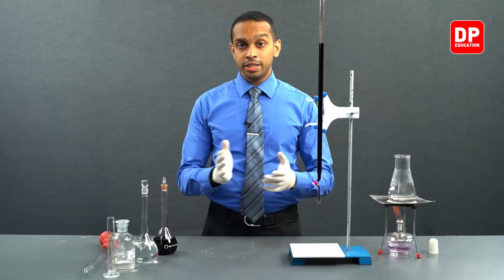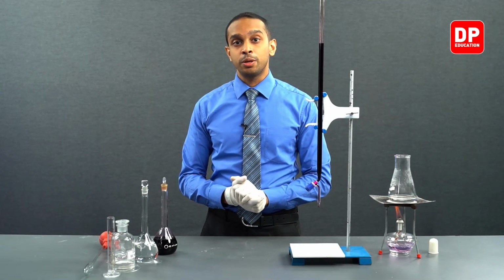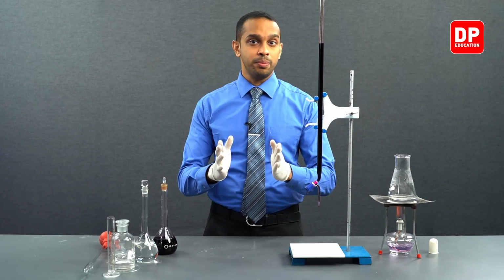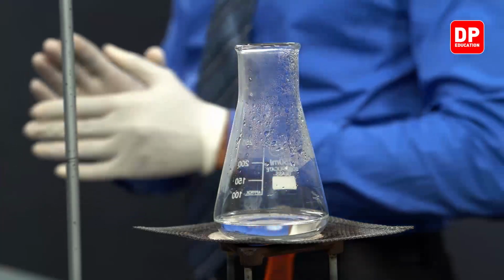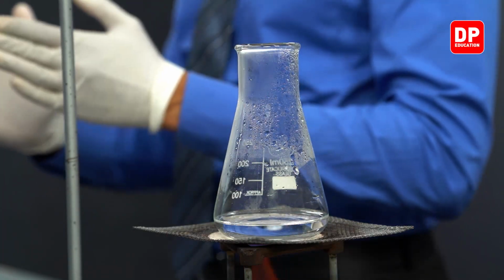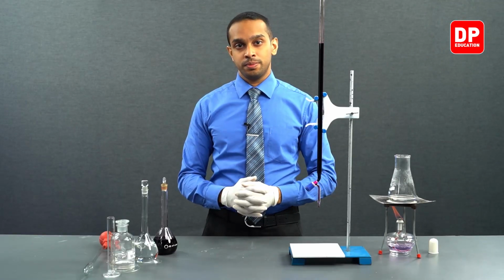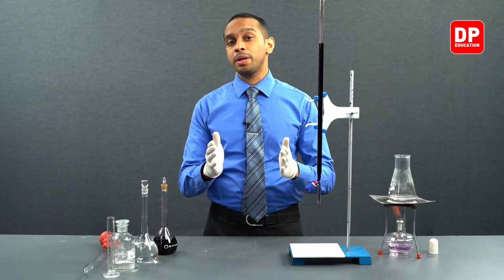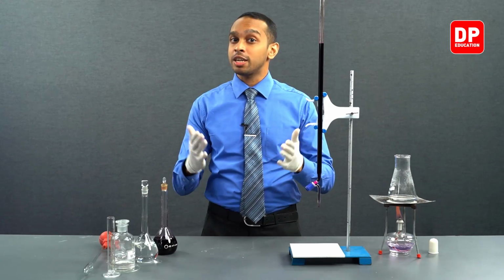Again, the reason why we are heating up this solution is because this reaction between potassium permanganate and the potassium oxalate in acidic medium happens at a slower rate at room temperature. So we need to make sure that we increase the temperature a little bit for this reaction to happen at a faster rate.